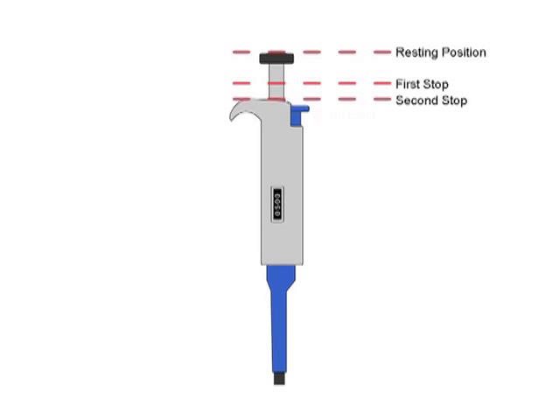The final moving part is the tip ejector. To remove the tip, push the tip ejector downwards.